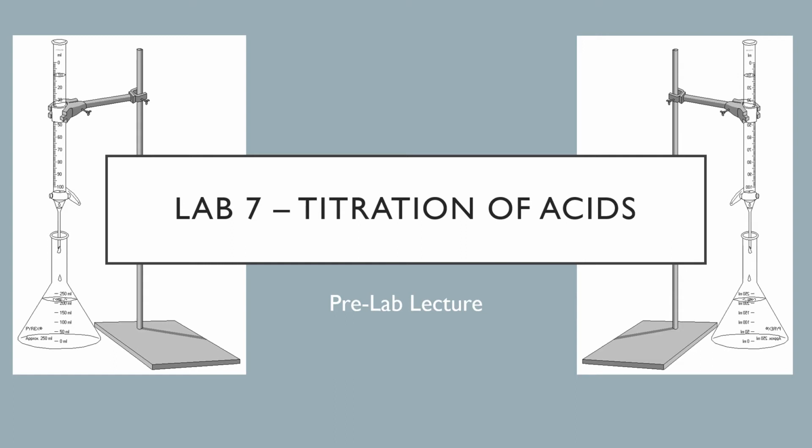So today we'll be going over the pre-lab lecture for Lab 7, just the titration of different acids. This lecture is mostly material from Chapter 15, which the lecture should be posted here pretty soon, so you can see my notes from there as well. On Chapter 15 that can aid your understanding of the material that's covered in this particular lab.